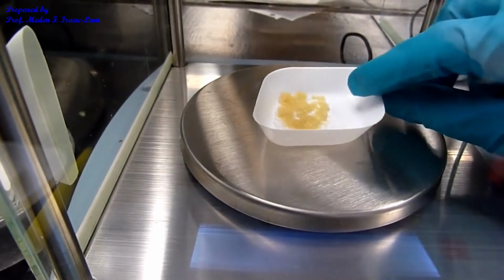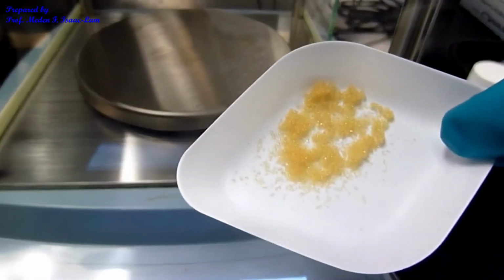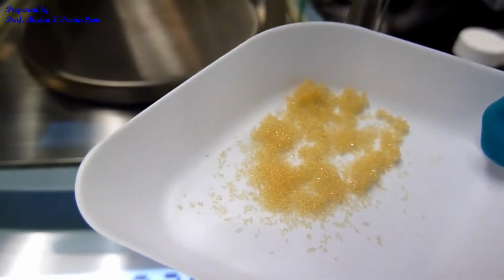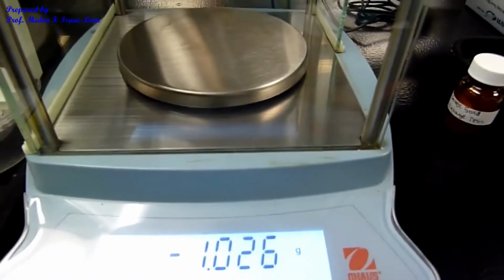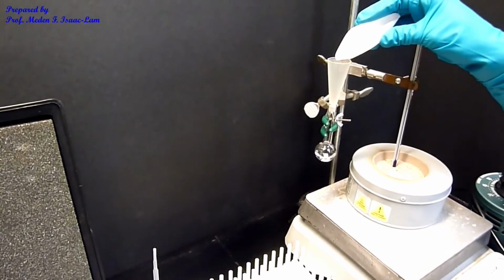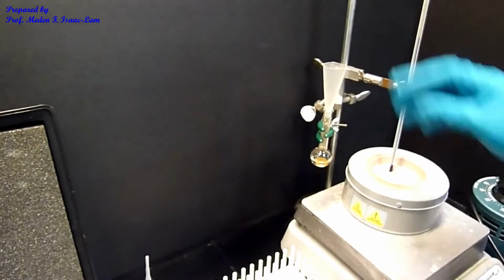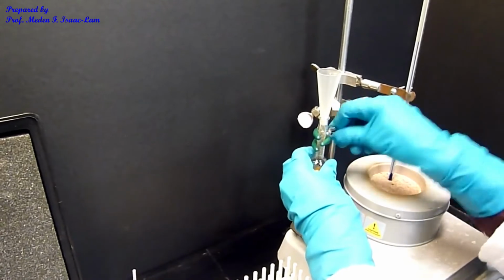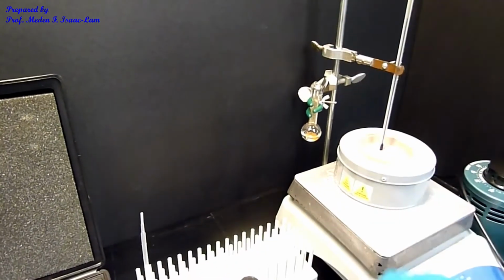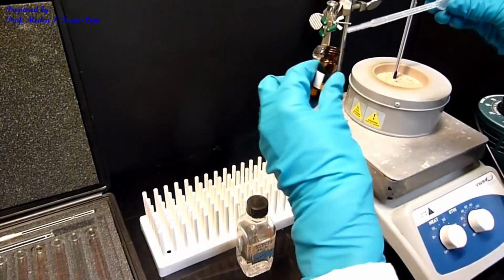So if I take this out, you can see it's like beads, yellowish in color. So this is the resin, and it's a cationic resin. So it has hydrogen in it as a catalyst. So now I'm just going to add the DOWEX into our mixture. And now it's inside. And I'm going to add the remainder of the alcohol, and then I want to rinse out the side.